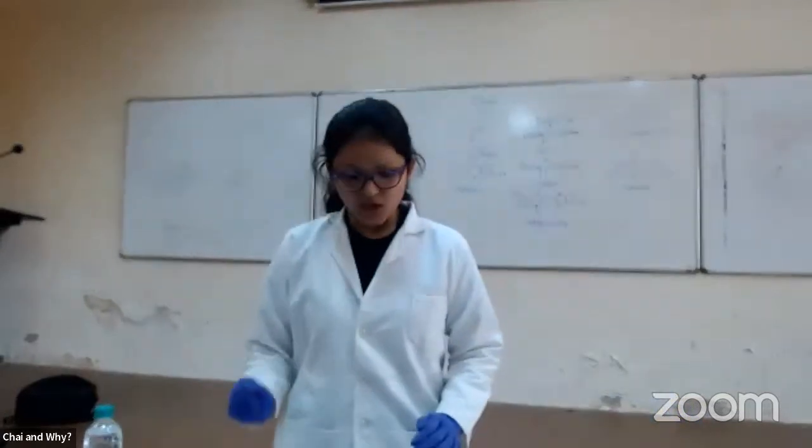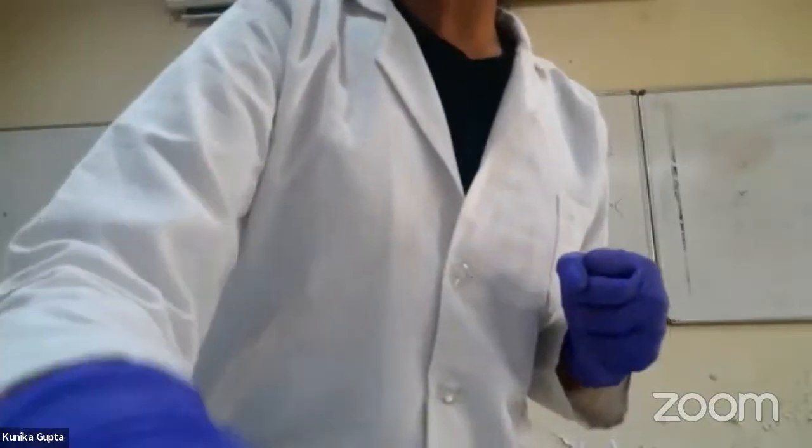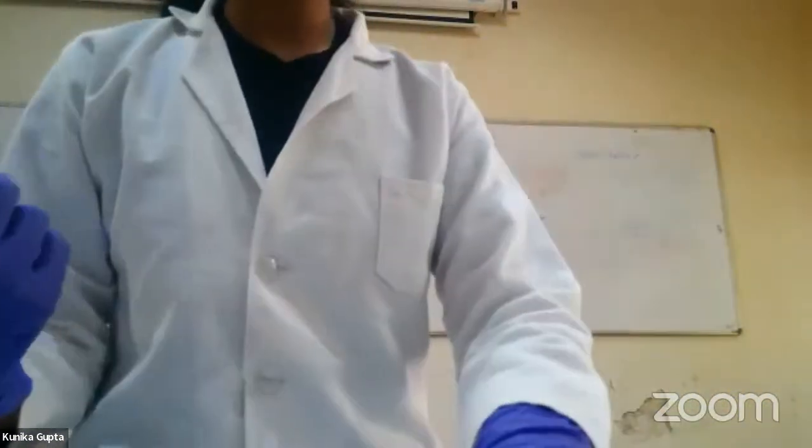So now this is one of the experiments that I can show you. As you can see, I have put a piece of ice and I put this thing into it. Because it's a chunk and not crushed ice, I don't think it's going to work. But still I'll keep it for a while and see if it actually does. So this is one of the experiments.